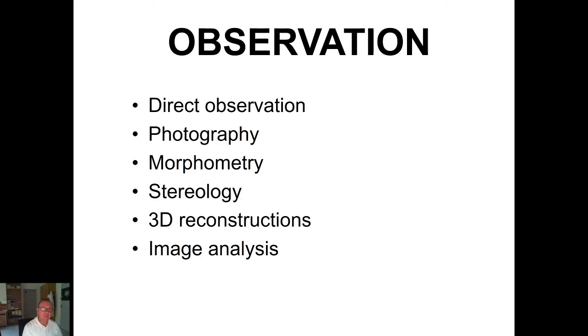So light microscopy is quite an old method, and during the longest period of its use, the only possibility how to store the picture was drawing. The microscopist observed the specimen and drew it on paper.